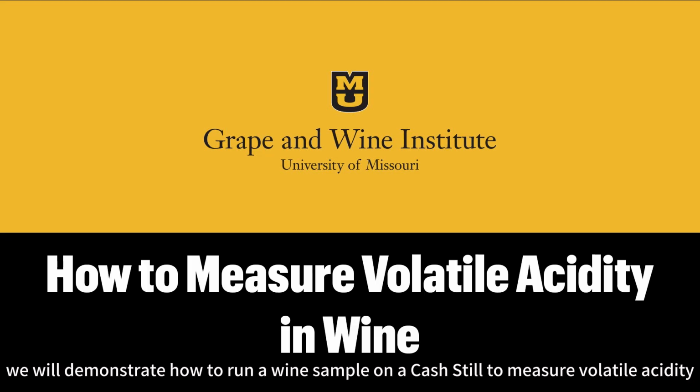In this video, we will demonstrate how to run a wine sample on a Cash still to measure volatile acidity.